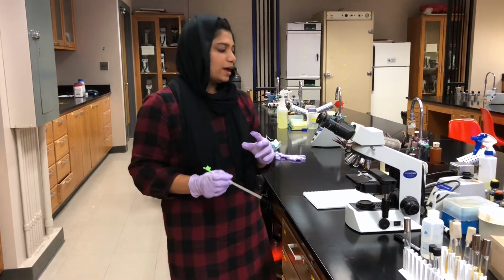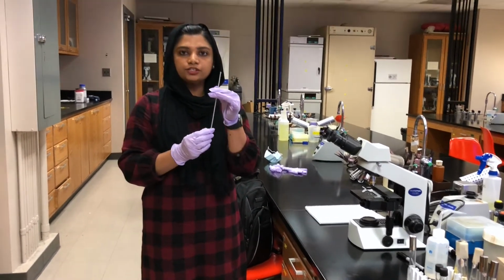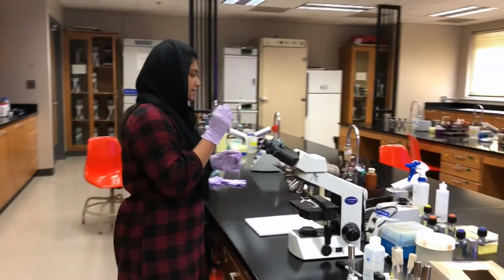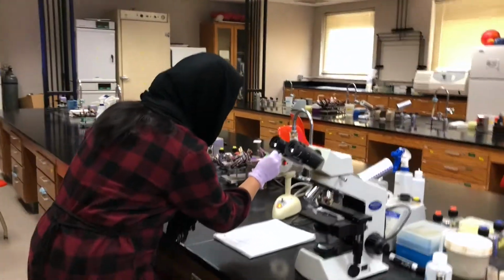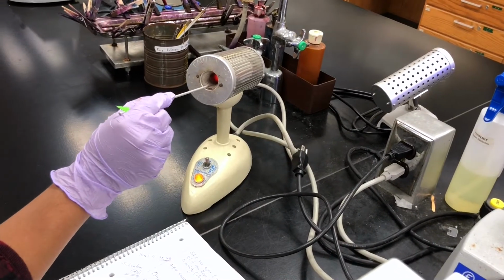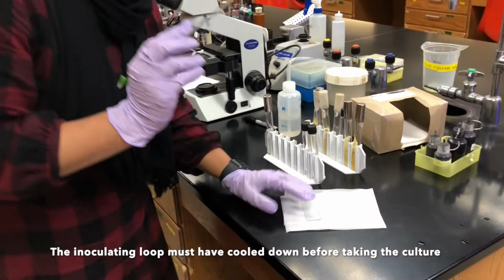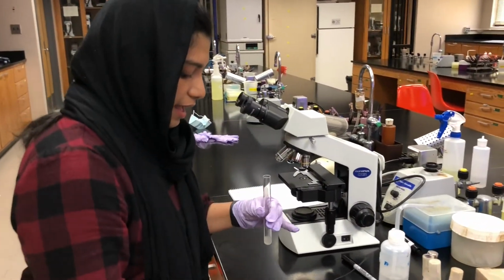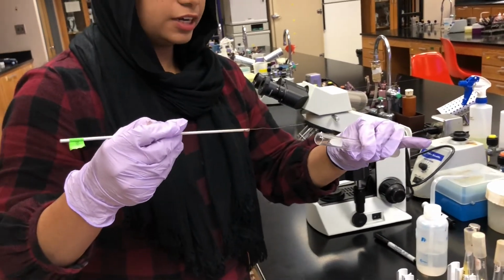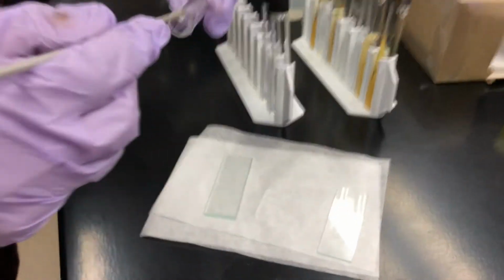Hi guys, now we are going to do the direct staining. For that I'm taking an inoculation loop and I'm going to sterilize it using this incinerator. I'm keeping it inside, as you guys are familiar with this. So now I'm going to take a glass slide and add 2 loopfuls of the culture onto the slide.